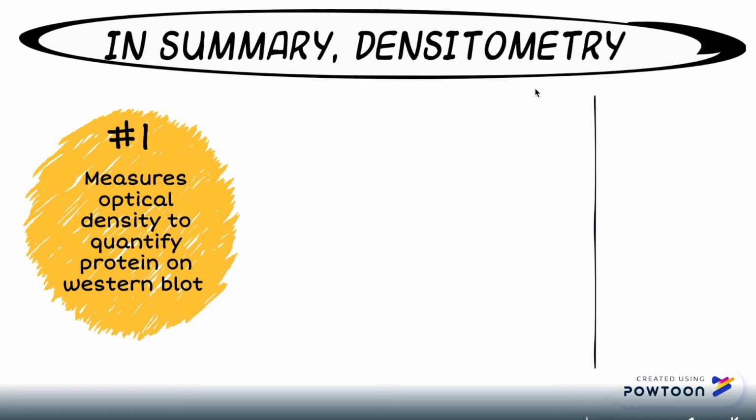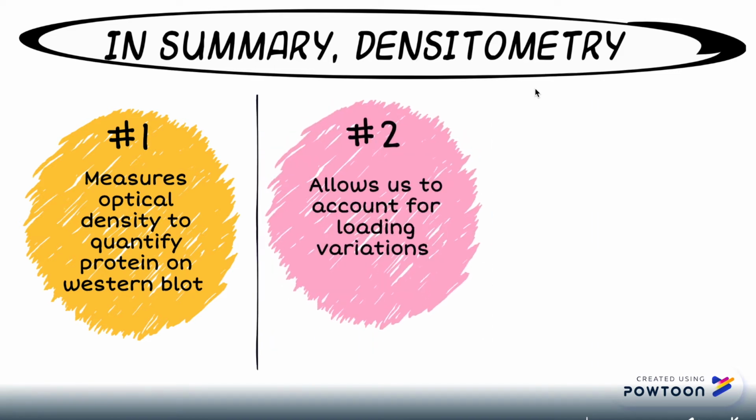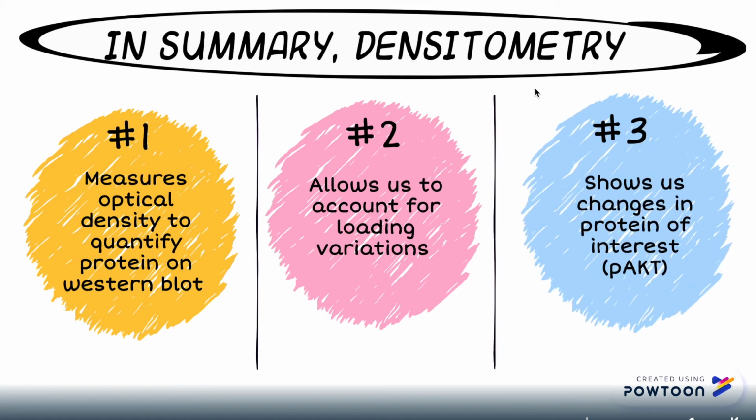It also lets us account for any loading variability as we use ratios of the protein of interest to the total protein within the same lanes. We can see changes in protein of interest upon quantification and comparing to total protein.